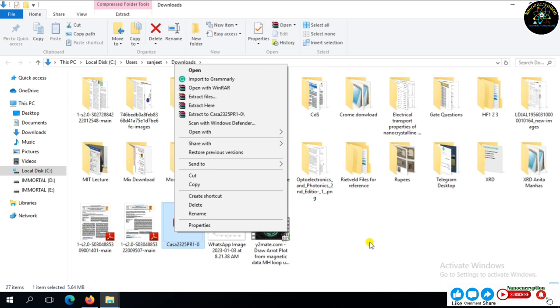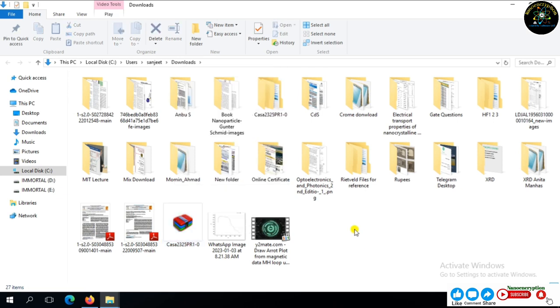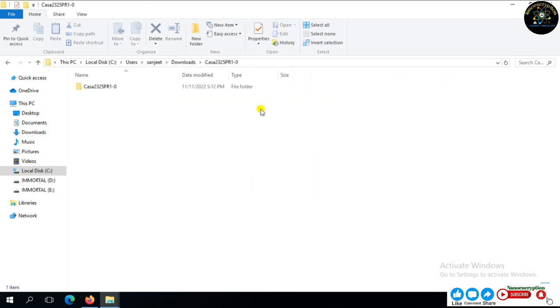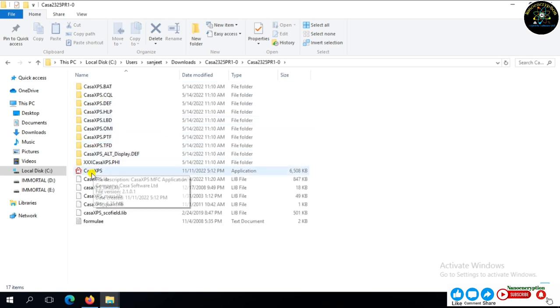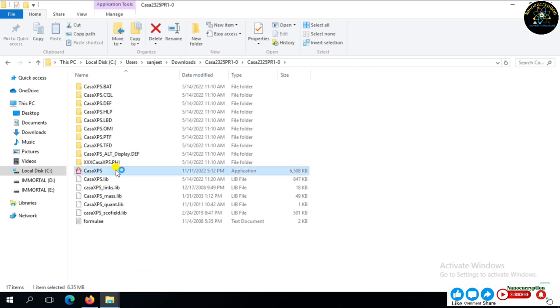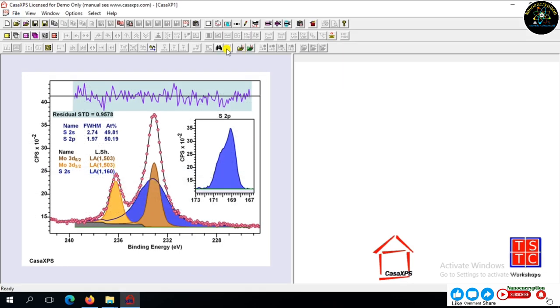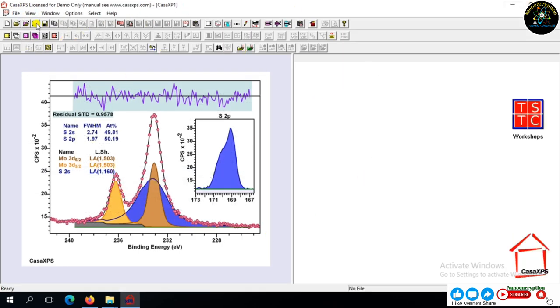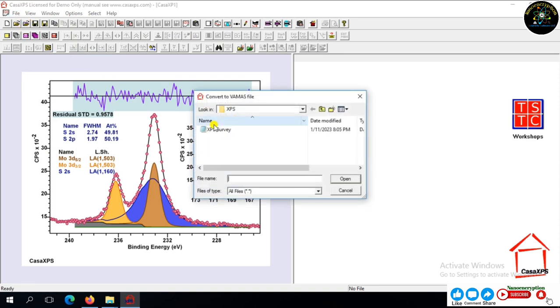I am not going to again extract this file. Just open the Kasa XPS software application. And after that, load the XPS Spectrum.